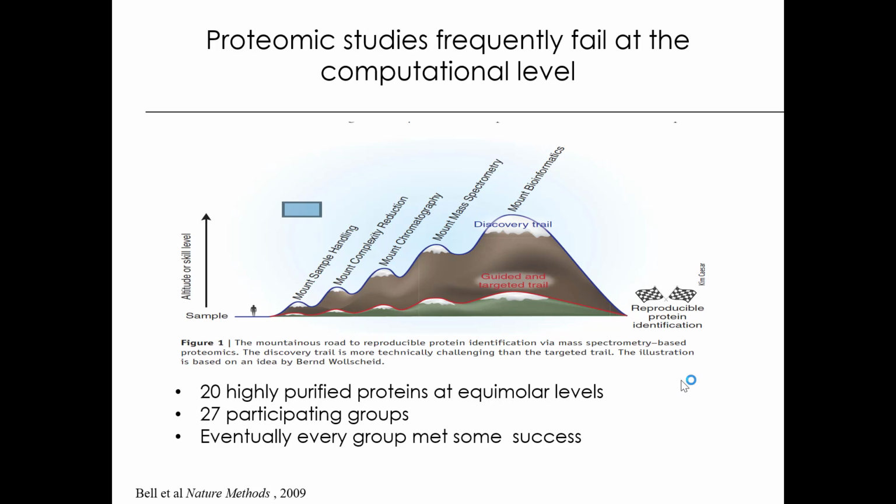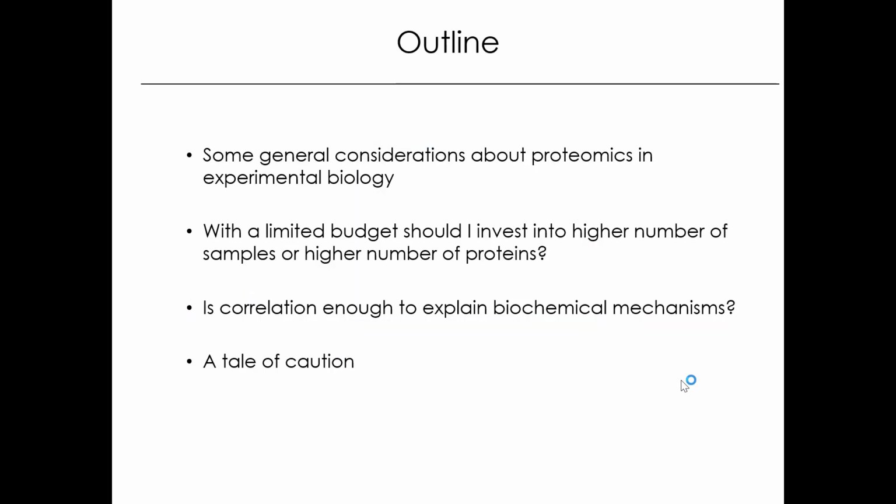This is the informatics part, the data analysis, and that clearly, I think, is true in general, and certainly also for DIA analysis. So that's the rationale. We'll focus not so much on how you digest the protein, although that's of course also important, but on the data analysis. So that's just the justification of the topic.